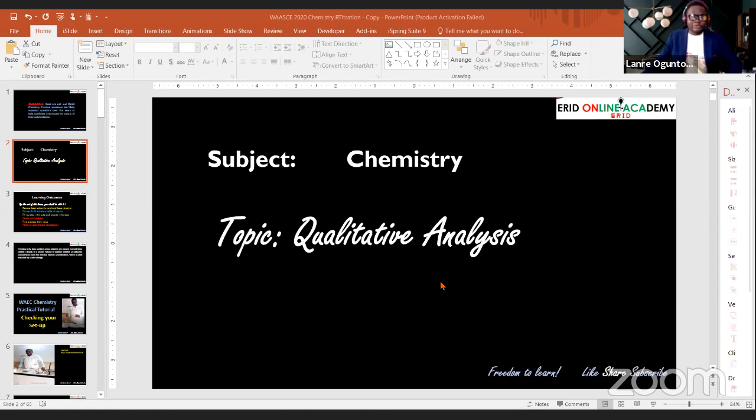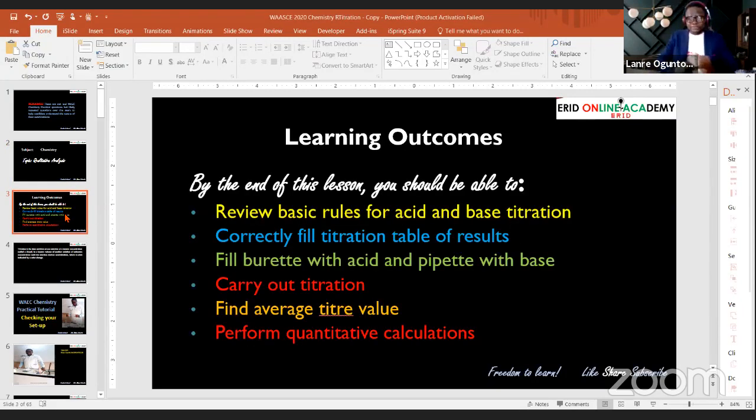Okay, so our focus for the lesson, number one, is we're going to review the basic rules for acid and base titration. You can jot down, but don't worry, I will send you this material. I also have recorded videos that I made that will assist you in your private study.